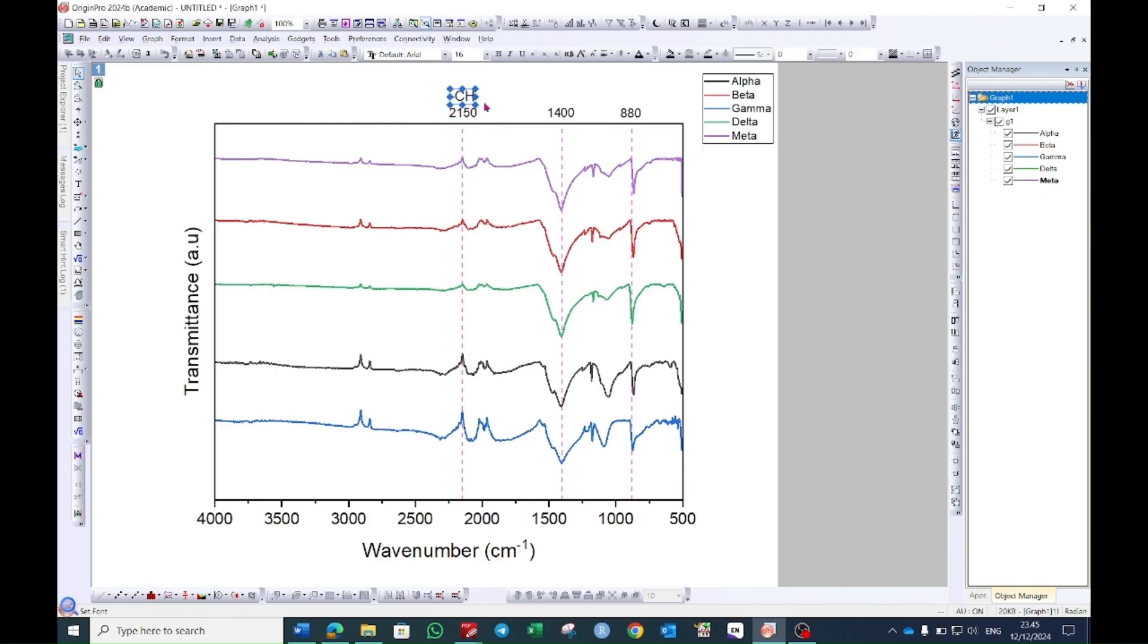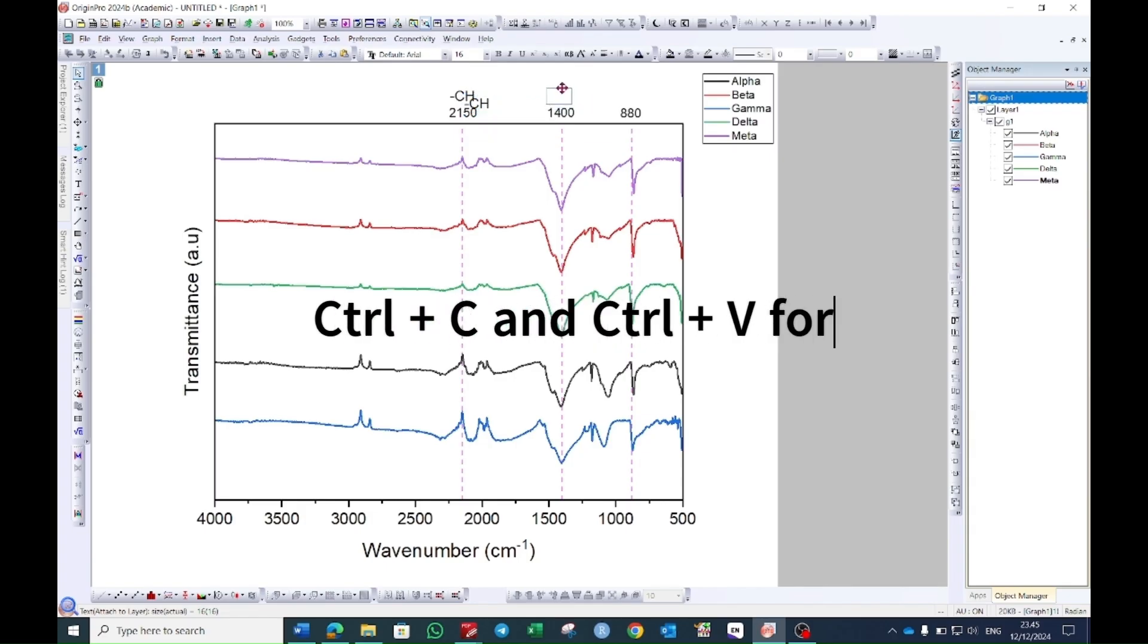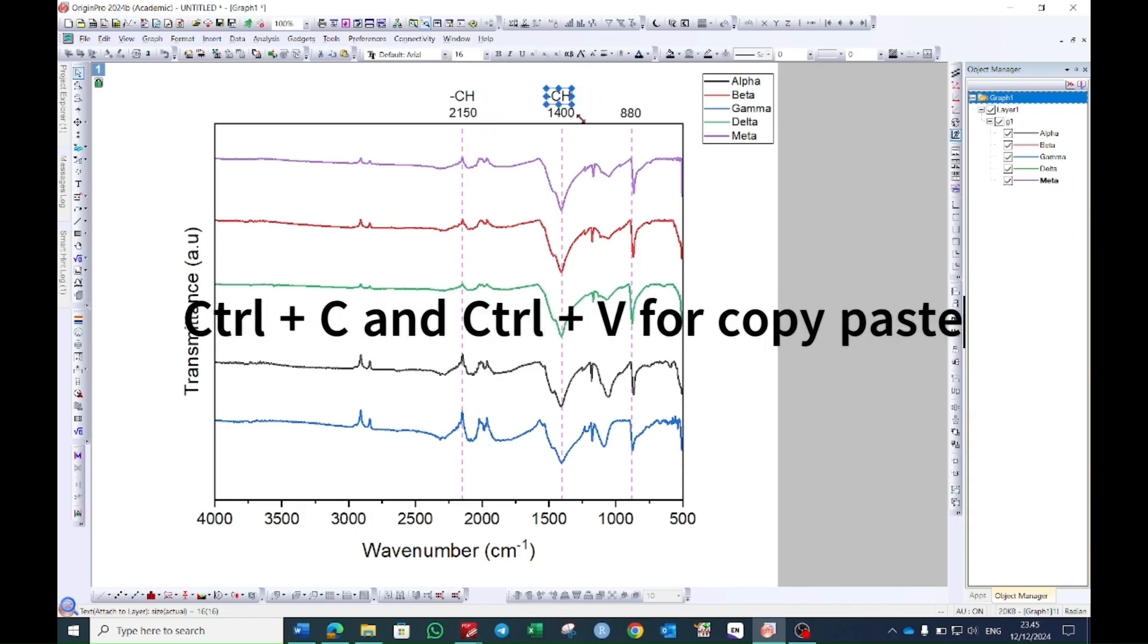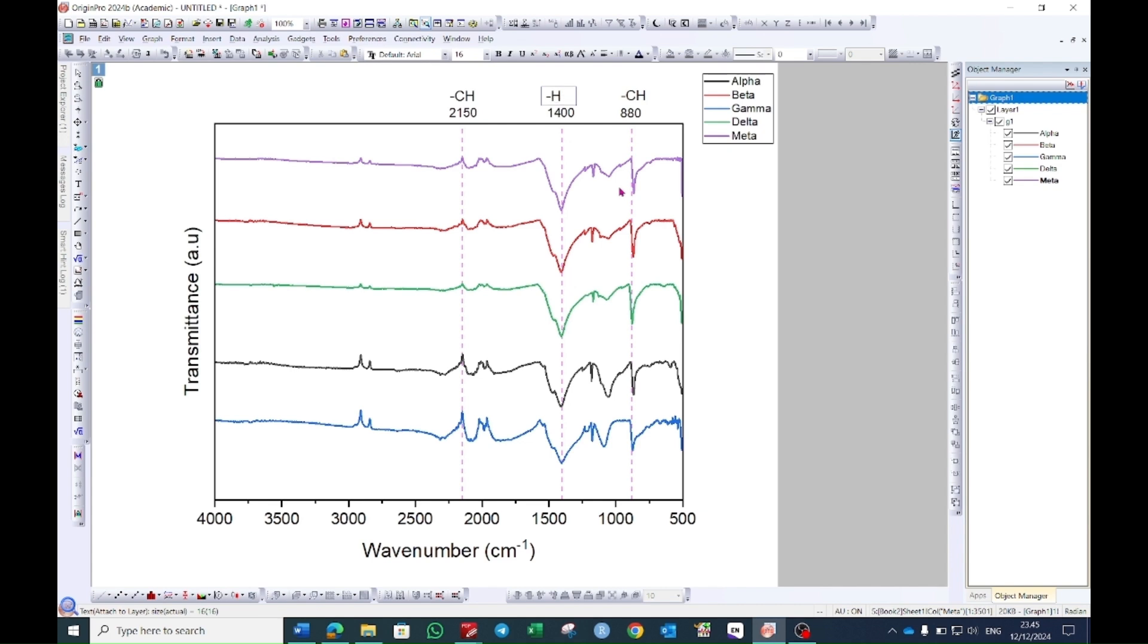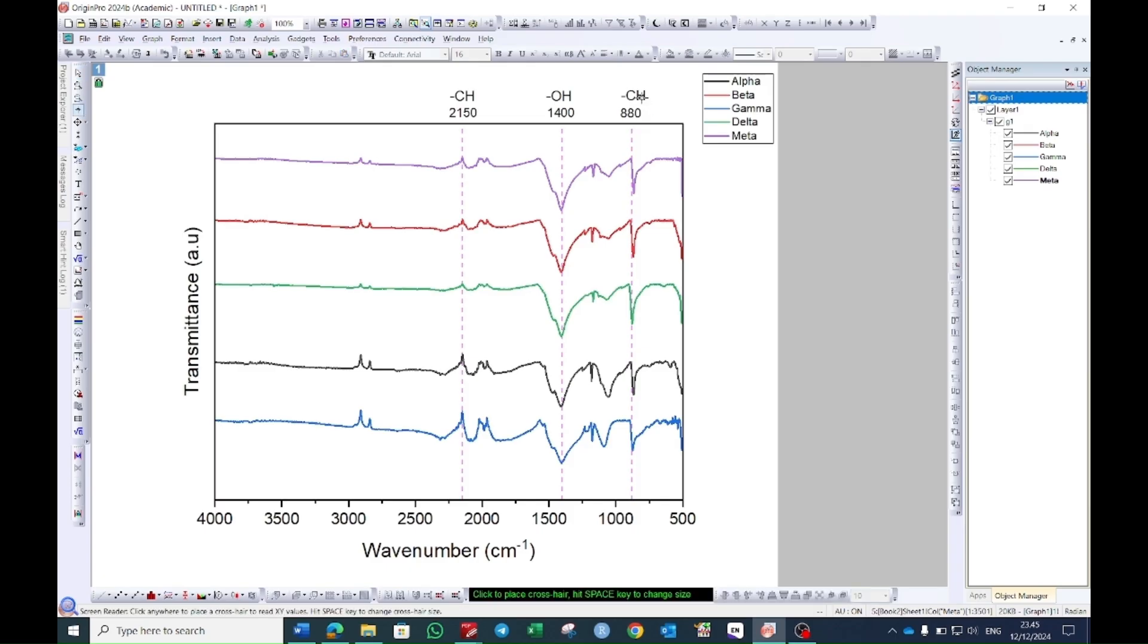You can then copy this one and paste it and then you can drag it to all of the peaks. And then you can double click on this one and then you can change the name of each of the peak.